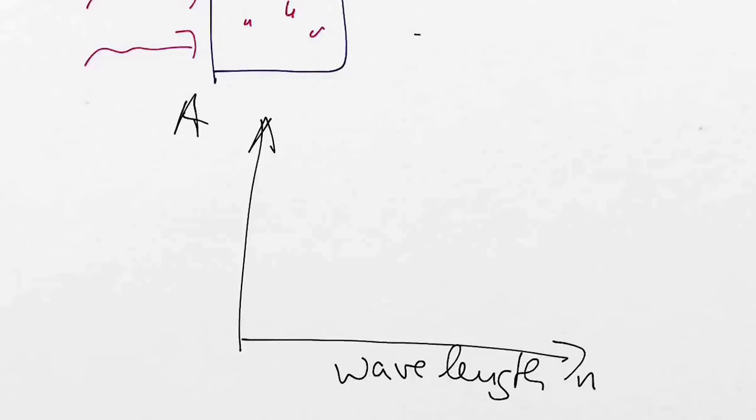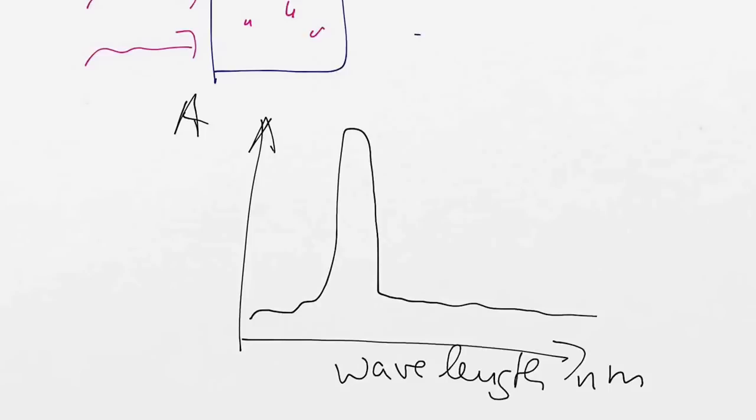That would be in nanometer. What's the unit for absorbance? There is no unit. Exactly. Wonderful. Thank you. So what you could see is something like that. So this particular substance has a very high absorbance at this particular wavelength here.